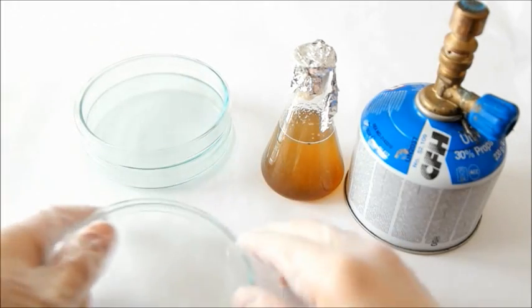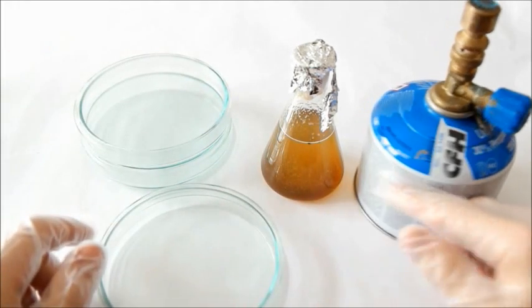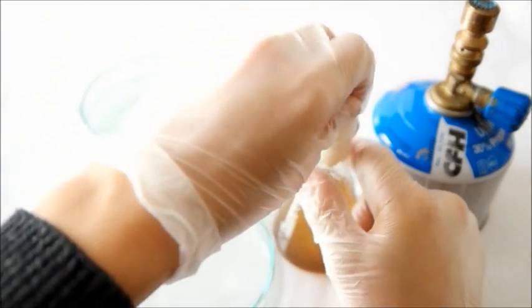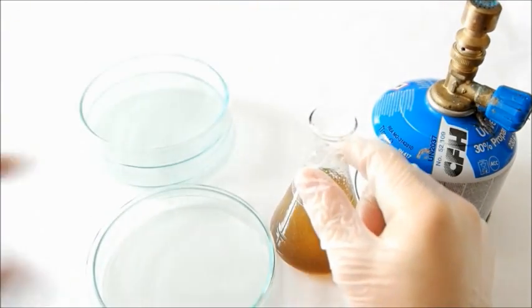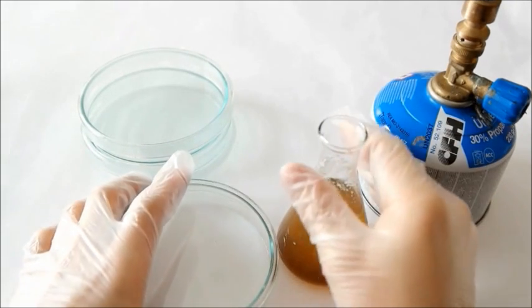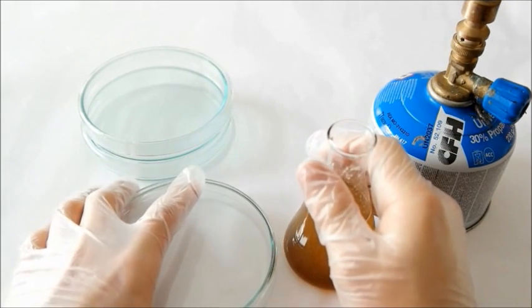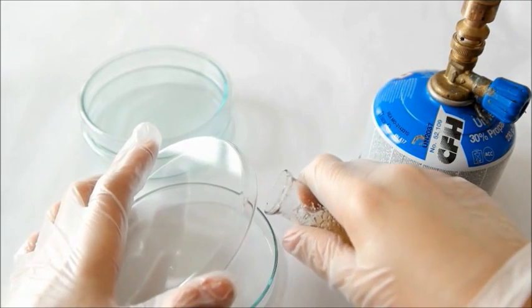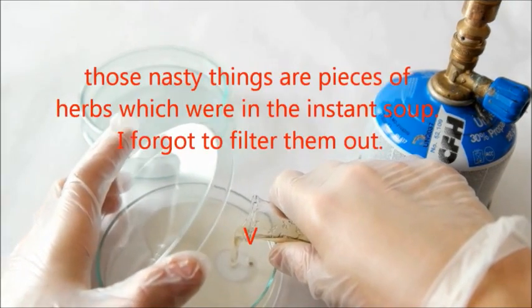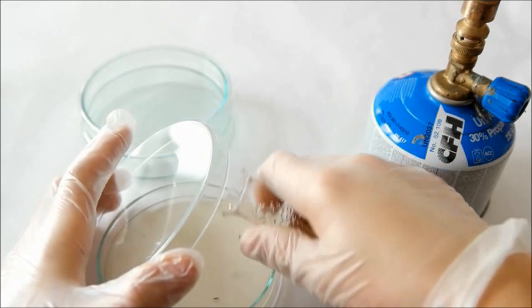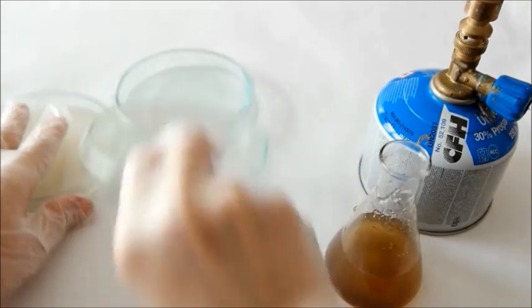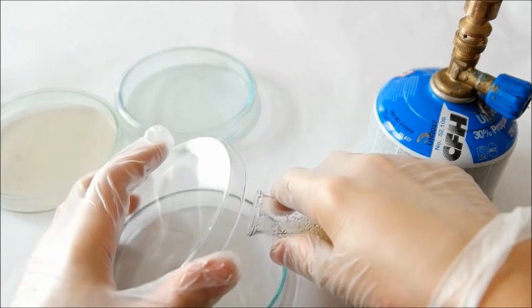So now take one of the sterilized petri dishes, open your flask and take out the cotton ball, and pour it slowly in your petri dishes. Make sure not to open it too much so that no bacteria can enter. That's double safety. And now we can pour the solution in the dish and do this with all of them.